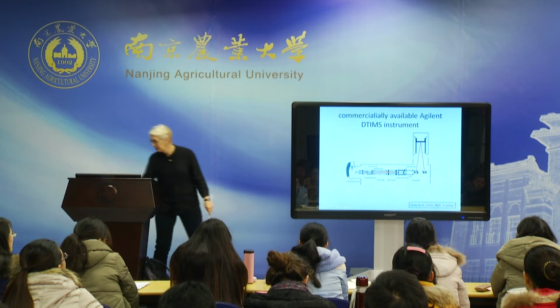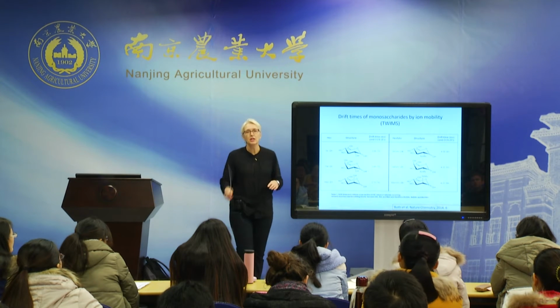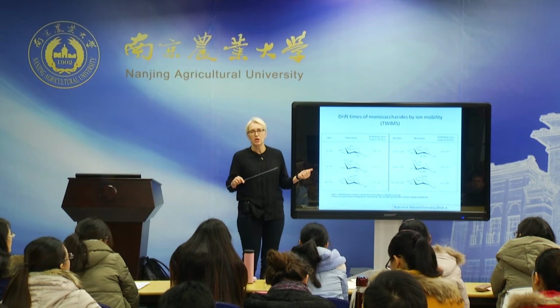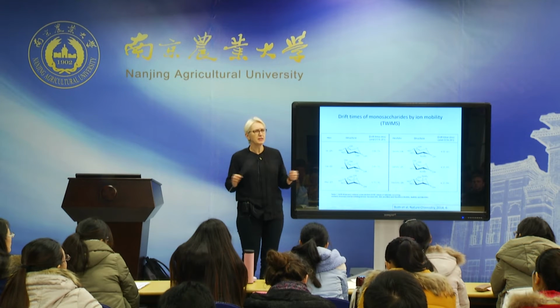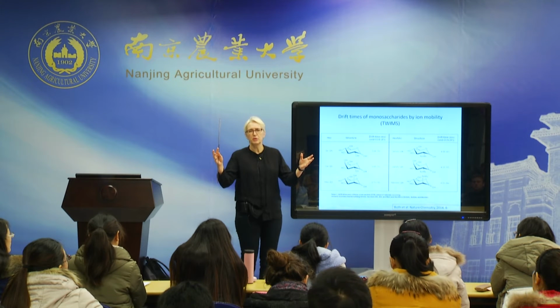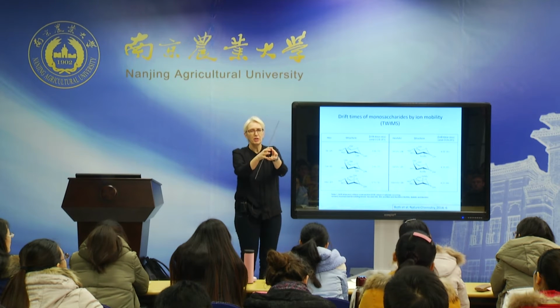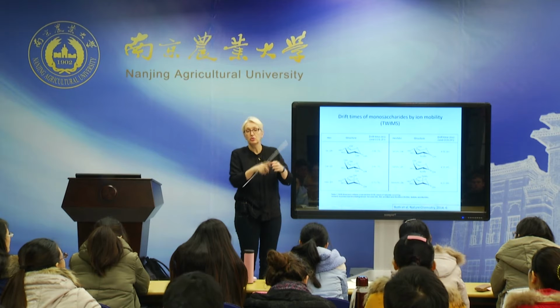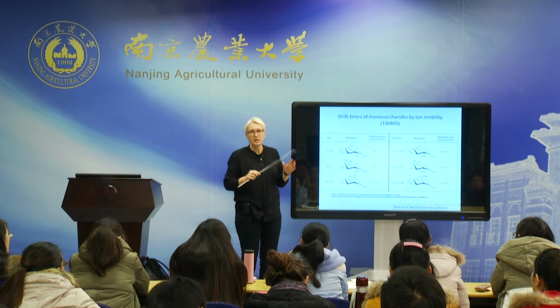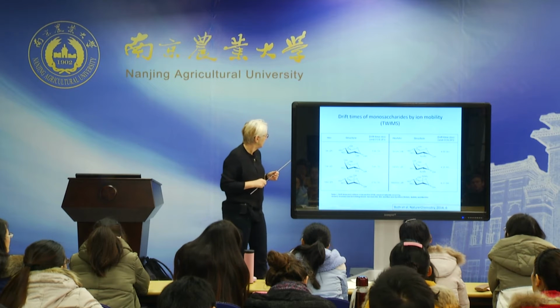So there are a lot of different things around. I should also say, a lot of this work, this instrument has been used for looking at proteins. There's a very, very successful group at Oxford in Britain, looks at protein shapes, assemblies of proteins. Do proteins assemble in sort of long line, or do they form very globular assemblies? And with this technique, they managed to show differences. Carol Robinson, I don't know whether anyone of you have heard of, but it's a really useful technique to look at shape of biomolecules in general.